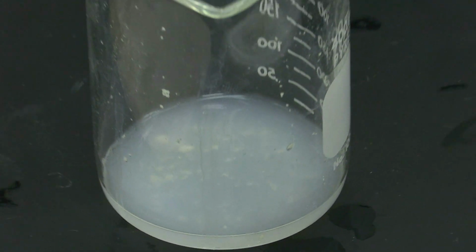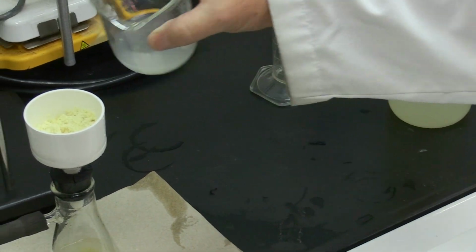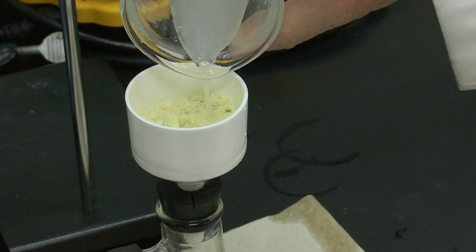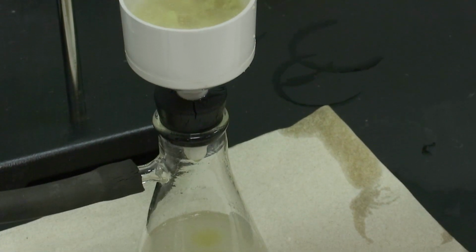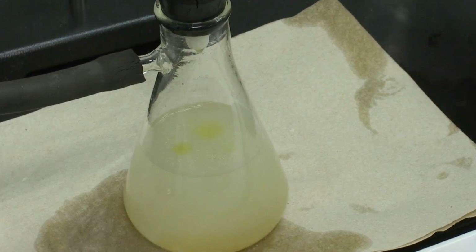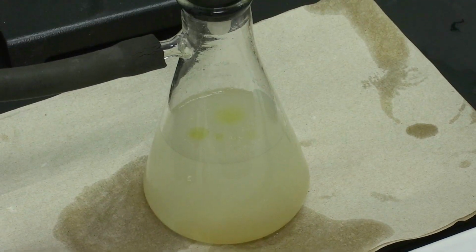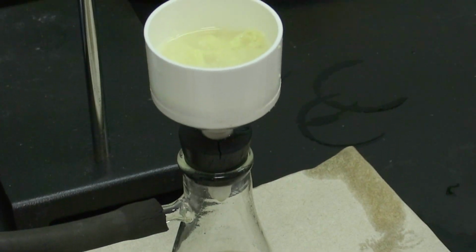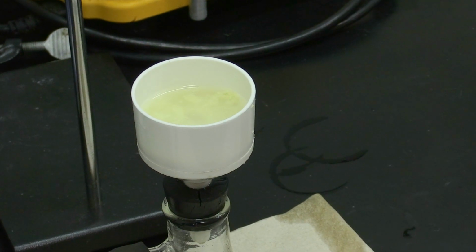So this is the remainder of the solution from part A. We've collected quite a bit of precipitate. We'll just let it suction dry for a little bit. A few minutes. Pretty much it.